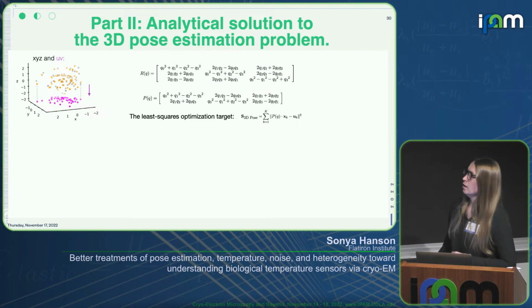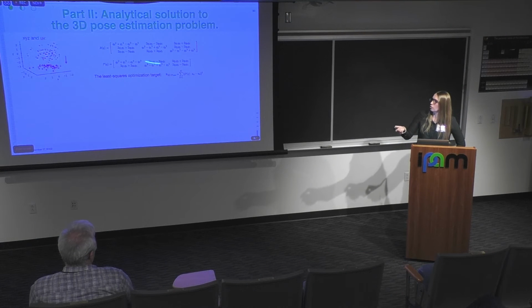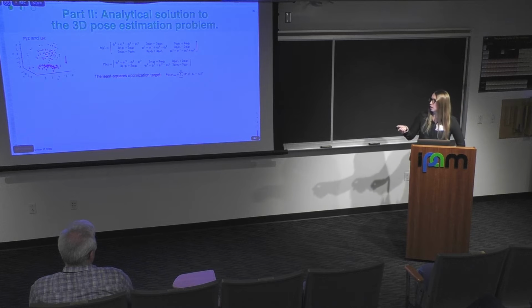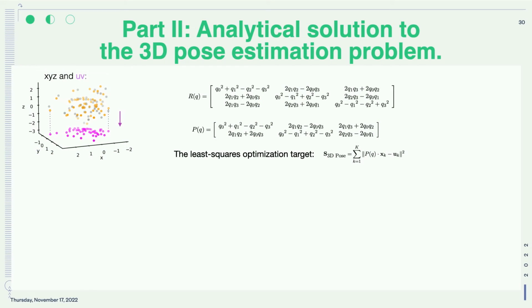And in this case, this problem is actually harder. We don't have a solution like RMSD because our rotation matrix in terms of quaternions is here, but when we have the projection matrix, and here we're assuming you're projecting on the z equals 0 plane, you have to remove the last line of that rotation matrix. And that gives you less information to minimize. We don't have the same solutions that we do to the RMSD problem.